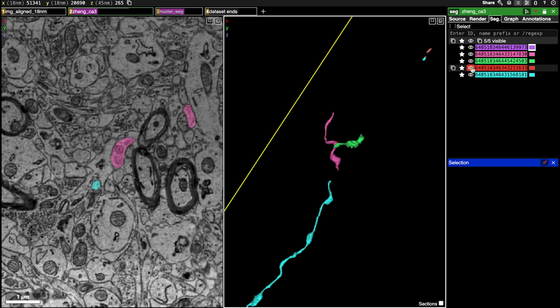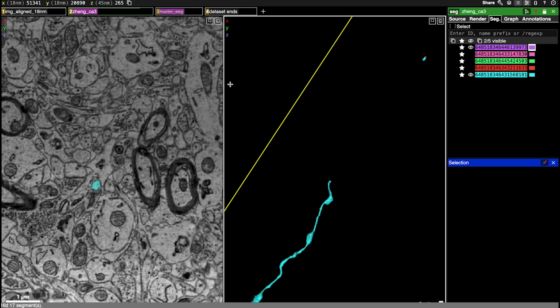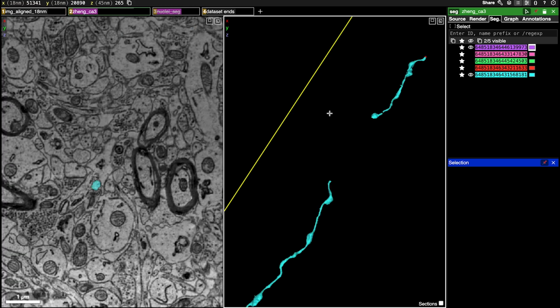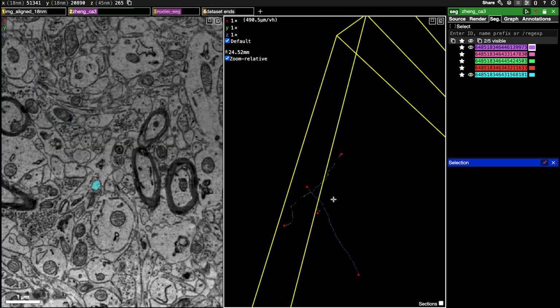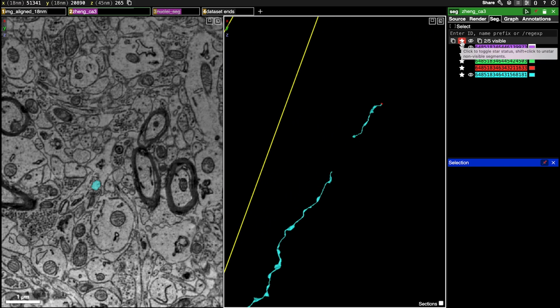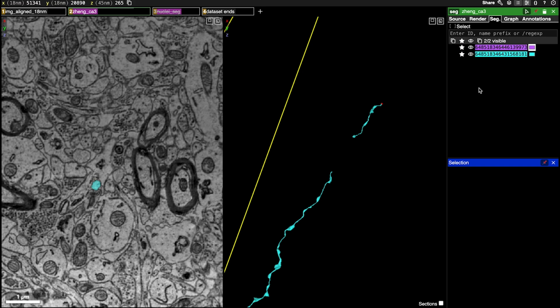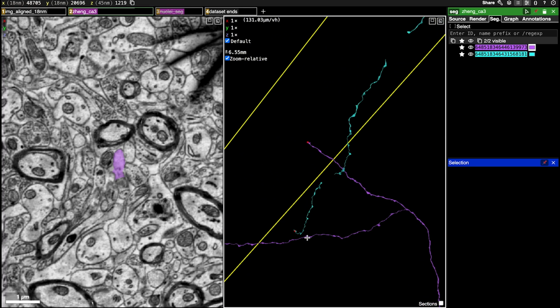Or another thing that you can do is I can hide these ones like this, the ones that I don't want. Make sure that this comes back correctly. Okay, and then you can shift and click the star, and that'll remove all your invisible segments, but just make sure you're holding shift because otherwise everything is going to disappear. Okay, so I'm going to do that, and then I just have my two segments that I wanted left. All right, so this is finished.